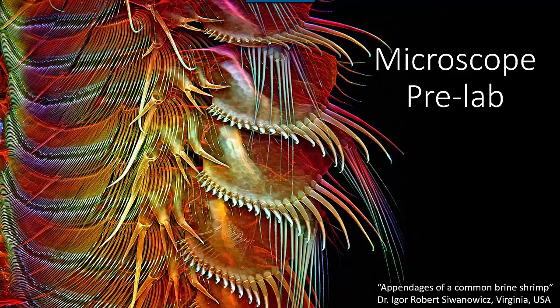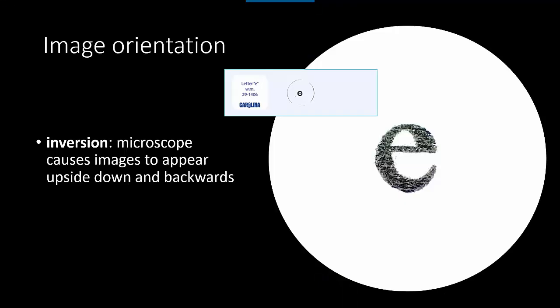This video covers information on properties of the microscope, preparing wet mount slides, and using a dissecting scope. The image you see through a microscope isn't an exact projection of what's on the slide. Aside from the object appearing larger, it's also inverted. Curved lenses in the microscope cause the image to appear upside down and backward.